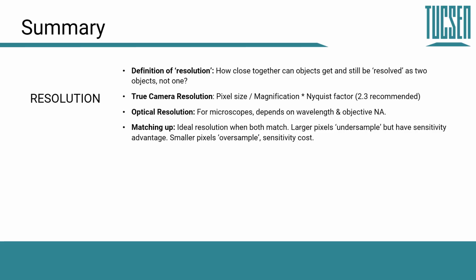We also looked at optical resolution, and for microscopes this depends on the wavelength of light that we're working with and the numerical aperture of the objective. For lens-based imaging setups, this is slightly more complicated.